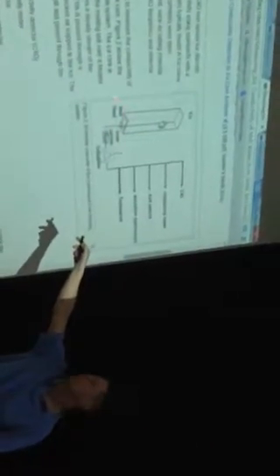So this group collected an ice core and put it on top of a heater, and this heater melts the water, so you get water flowing here. You're taking the gas out with the debubbler, and then they're measuring different things. They use the C4D to measure the conductivity. They also compared that with a benchtop conductivity meter, and they did various other analyses like dust particle absorption spectroscopy and fluorescence. So this was the equipment they used.